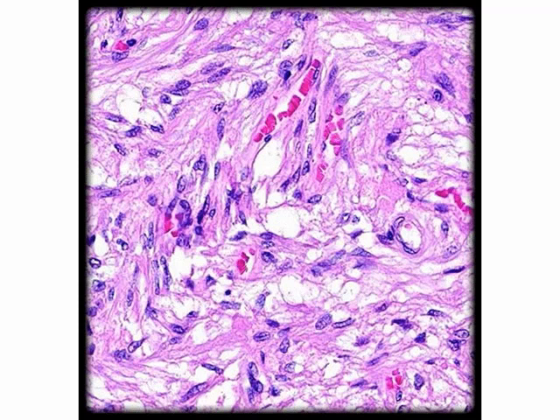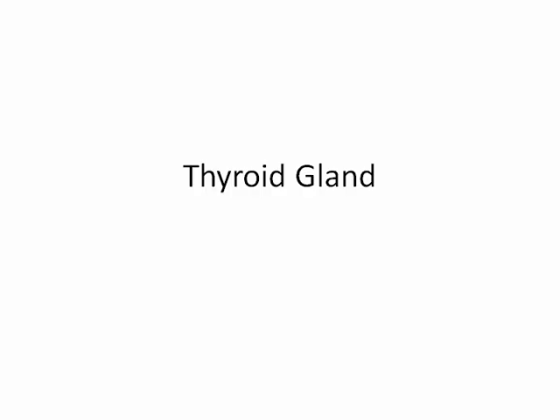I hate to tell my students to do a Google search, but the Google image searches can show you lots and lots of these micrographs. So you're not just focusing on just one picture. You can see it with different stains. You can see different slide preparations, and that's always good as you're studying these different organs.